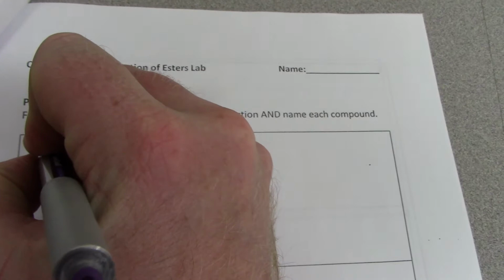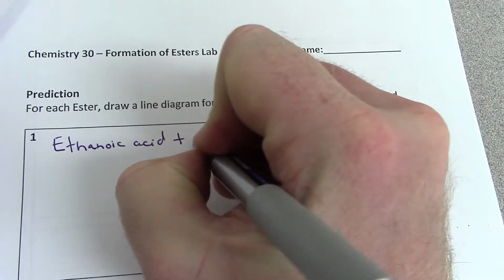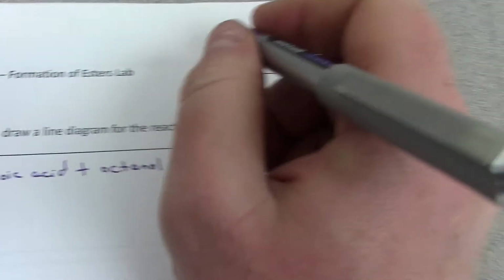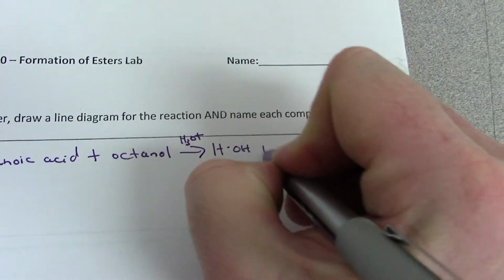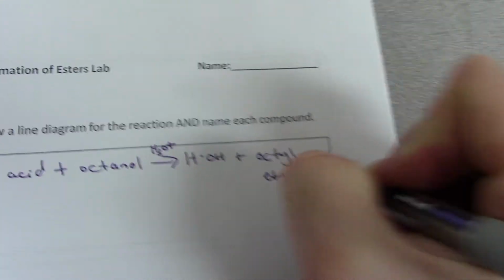For number 1, I have ethanoic acid plus octanol, and I'm going to use a strong acid to create esters. This should make HOH plus octyl ethanoate. So it's your job to name the ester properly.